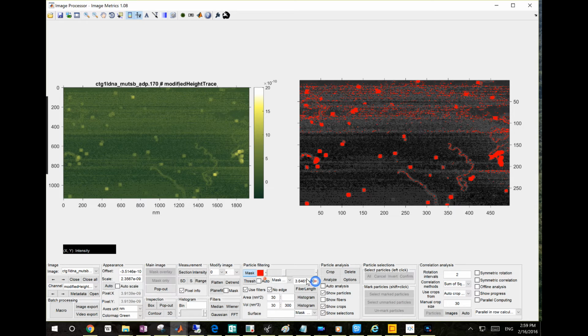And then you can also threshold the standard deviation map. That's pretty useful. So I want to see the standard deviation only above like 2 nanometer. Hopefully there's some. Okay, there's nothing. Then we can just go a bit lower. Yes, we actually see something. So see they are masked by red. Oh yeah, there you go. So above 1.2 nanometer standard deviation, we have several spots there.